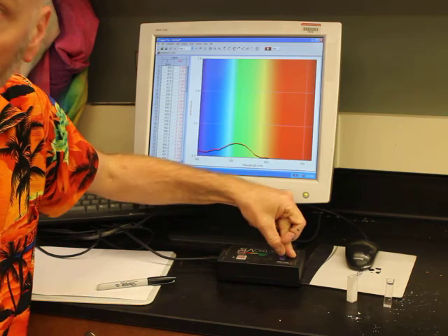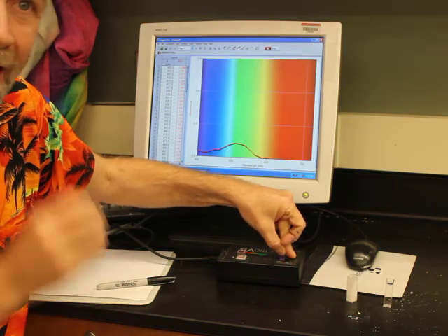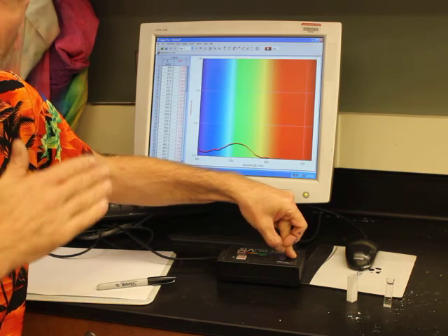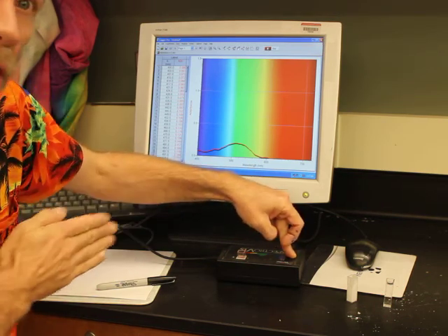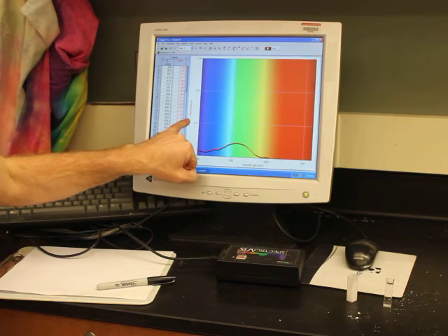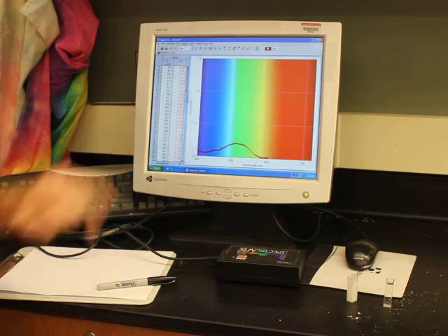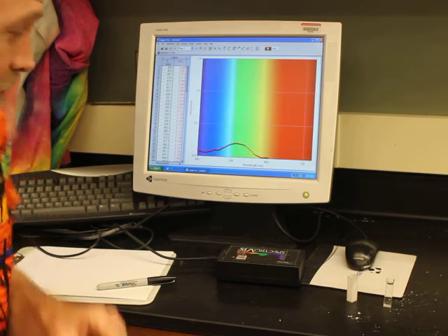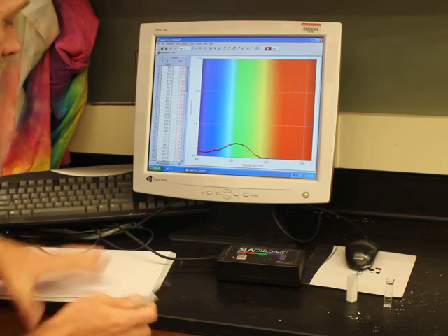Then it turns again. Different frequency, count. Turns again, different frequency, count. And it does that several times a second, going back and forth over all of the different wavelengths, right? And so what it's measuring is what is known as absorbance. Now, absorbance is a mathematical construct. We have to talk about it for just a brief second.